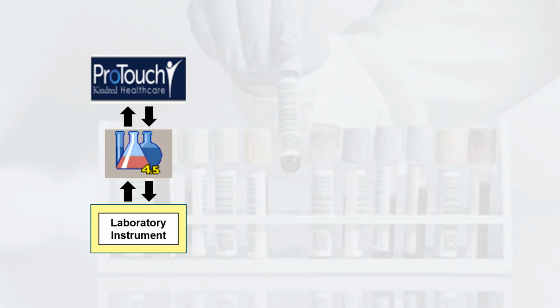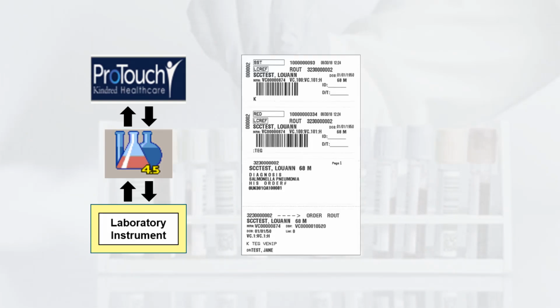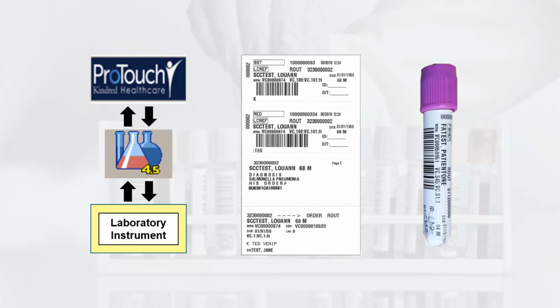In this module, we looked at an overview of the system workflow for lab orders, SoftLab labels and when they print. You also learned how to properly label a specimen using the SoftLab labels. And now, let's see how much you remember.